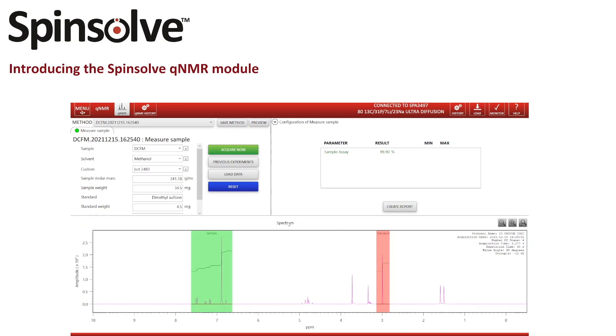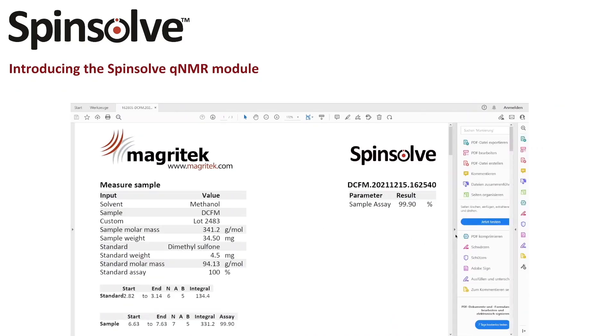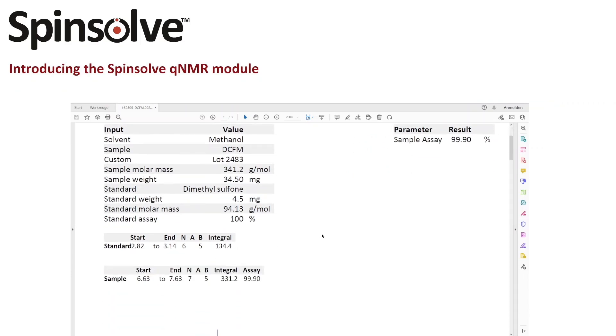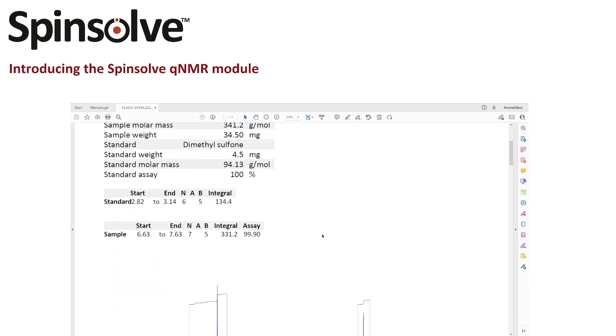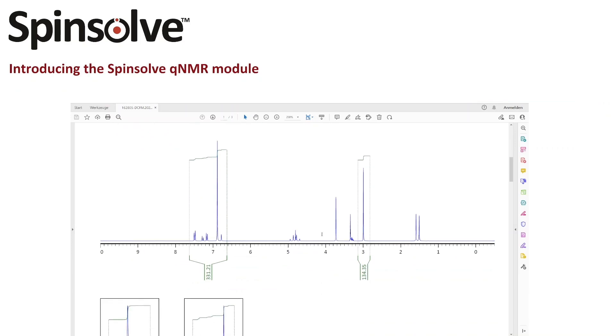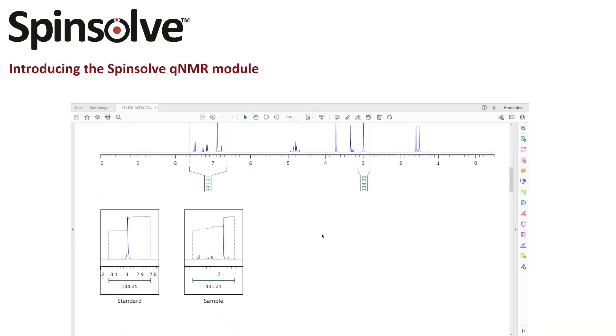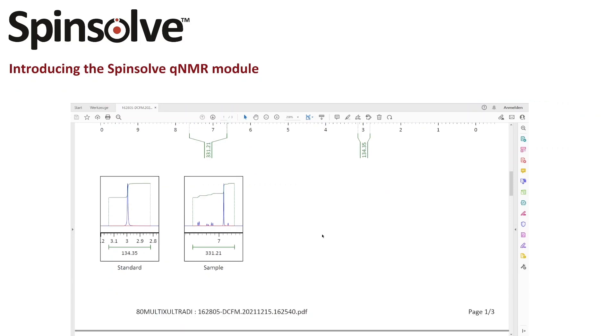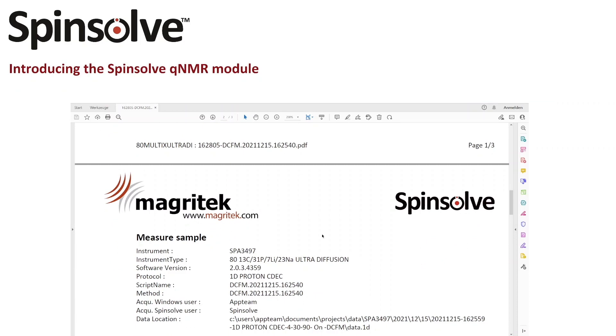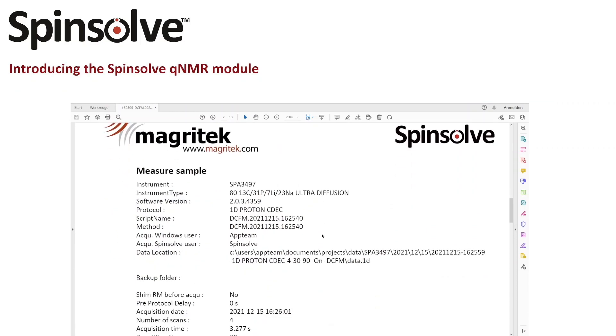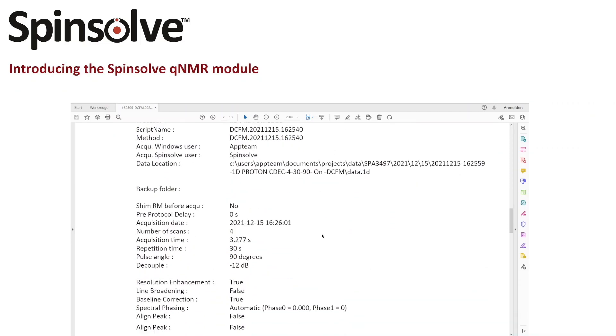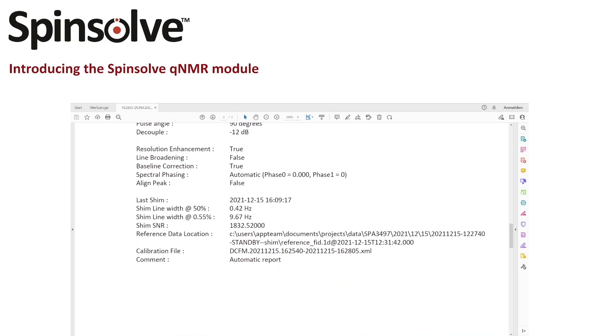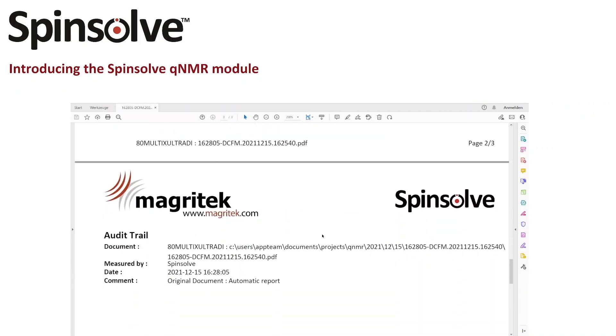After the experiment is finished, a PDF report is generated automatically. In this report every detail of our measurement is documented, including the integral regions and values, instrument specifications, information about the shim values and the data paths, and of course the complete audit trail.